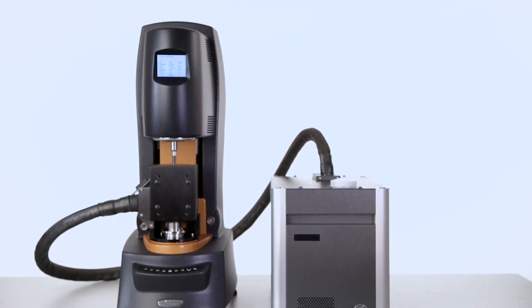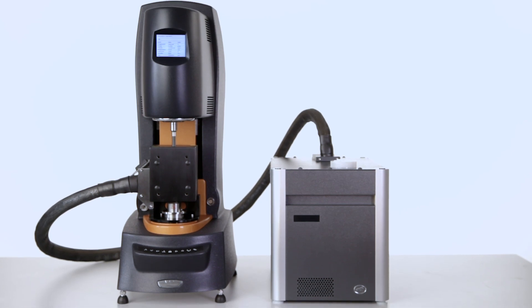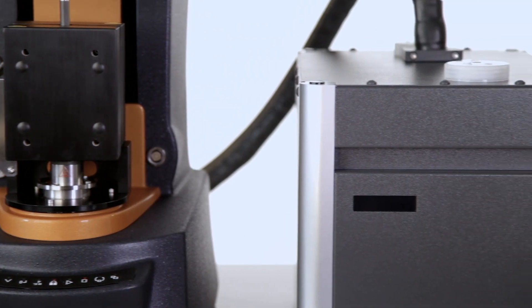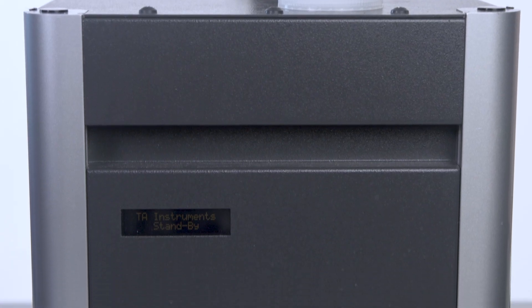Hello and welcome to another TA Tech Tip. In this Tech Tip, we will demonstrate how to set up the relative humidity accessory to a DHR rheometer. The relative humidity accessory on the DHR rheometer is a powerful tool which allows users to monitor the rheological property change of a material under both controlled temperature and humidity.